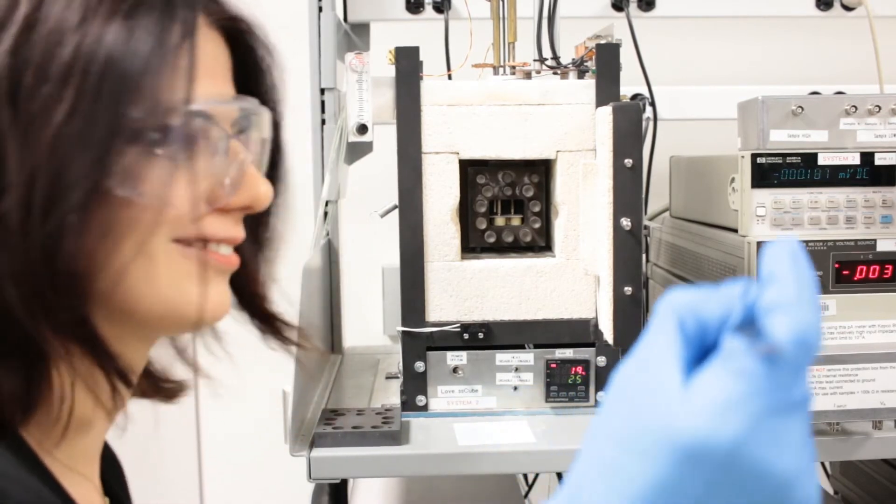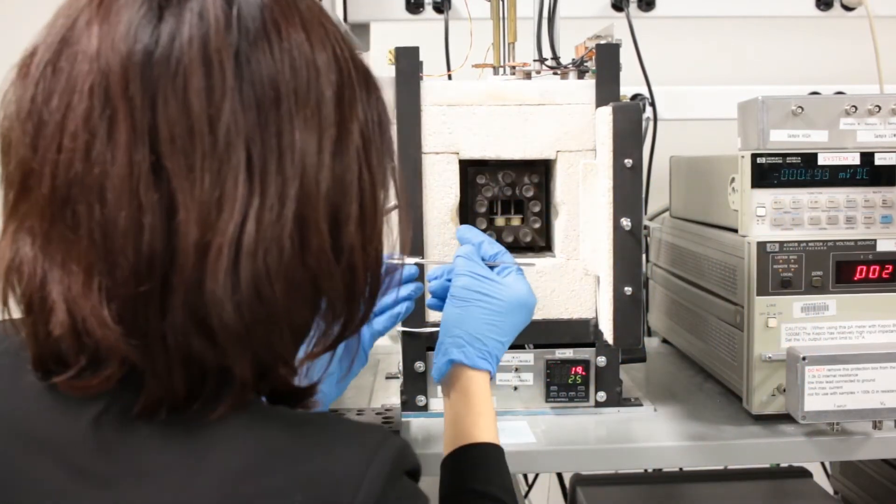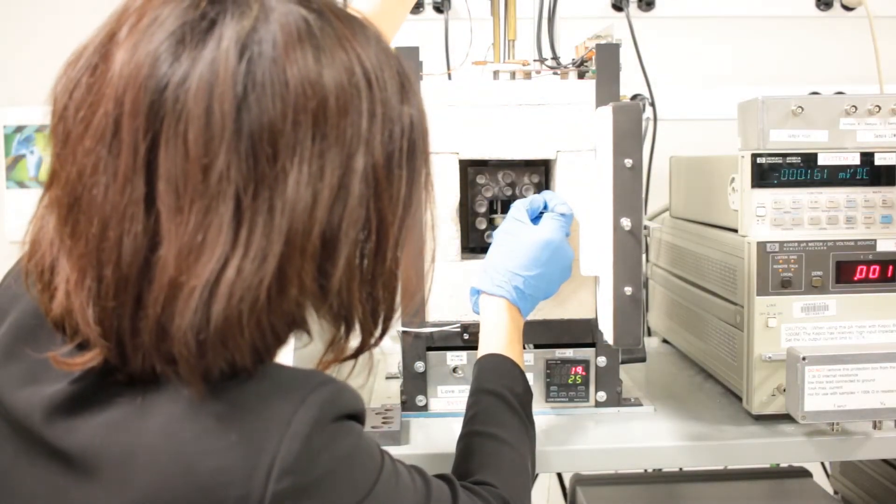In this lab, we have different fixtures to perform TSDC measurements of bulk and thin film samples. For thin film measurements, we use either a cube furnace or probe station.